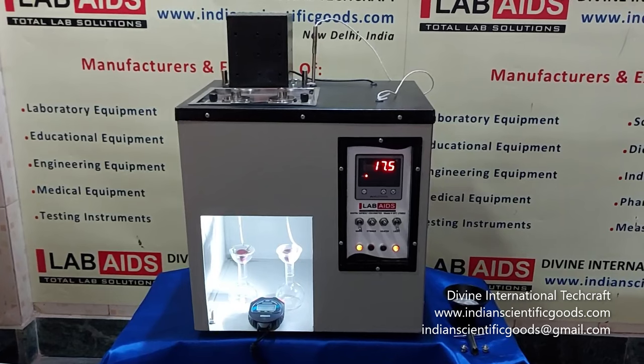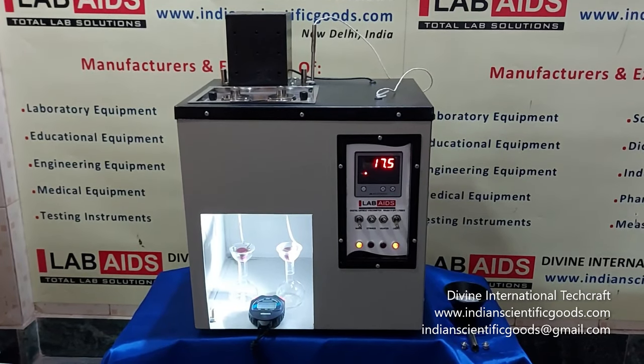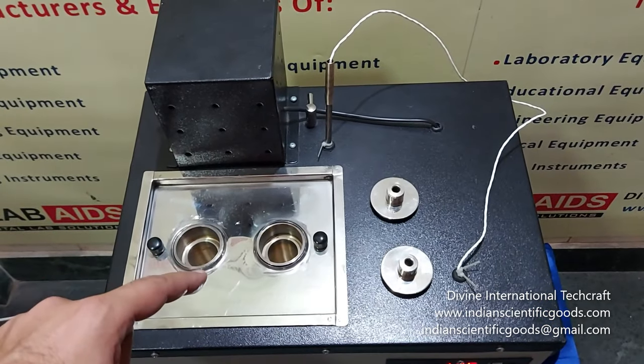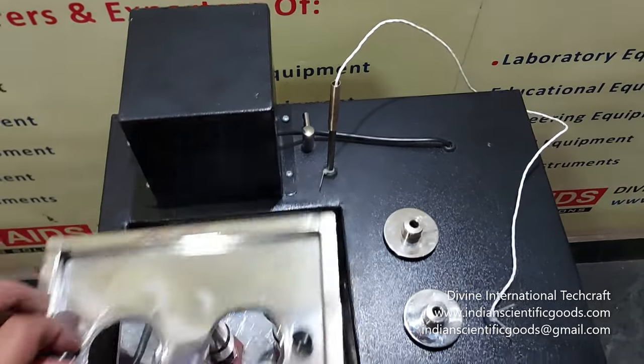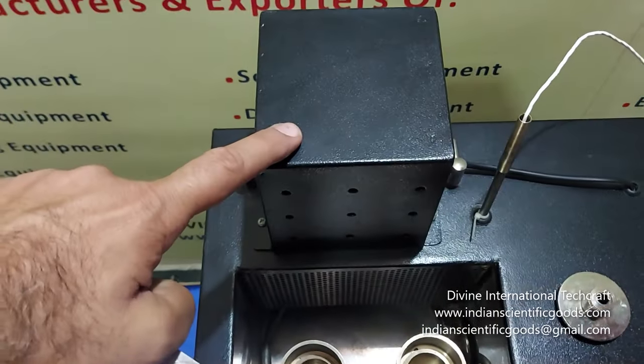The viscometer can be used for temperatures between 21 and 99 degrees centigrade. The viscometer consists of a stainless steel bath with two sample cups, a heater and a stirrer.